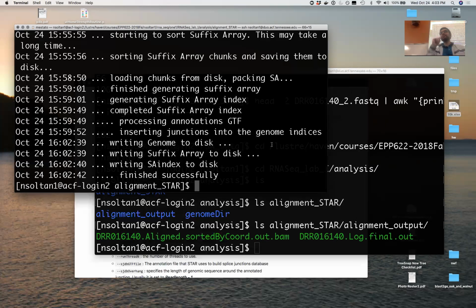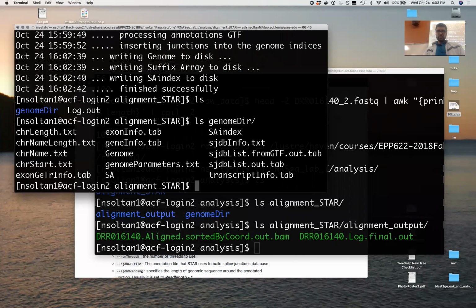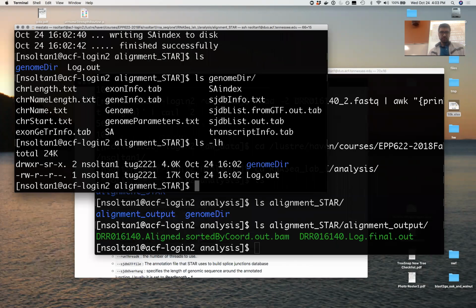I think it's better not to run it. Here's what I think we can do instead. I'll show you how to do it on the command line. I haven't written the homework for this week yet, but we'll give you a qsub script and you can paste in the commands and run it. You can create the script and then just launch it, and it'll run over the next few days whenever there are resources on the ACF. And then you'll have all the files in your directory by the time you get back on Monday.